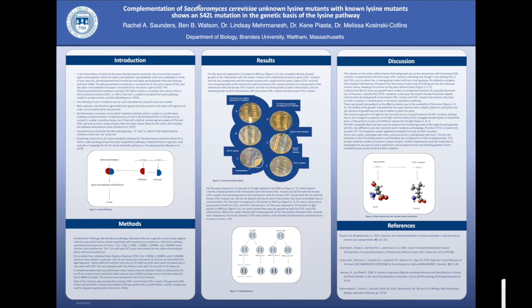In this experiment, we looked at the yeast strain Saccharomyces cerevisiae to determine the locus of the lysine 5, or lys5, gene, which is a major part of the lysine pathway in the genome of this yeast, and the lysine pathway in general.